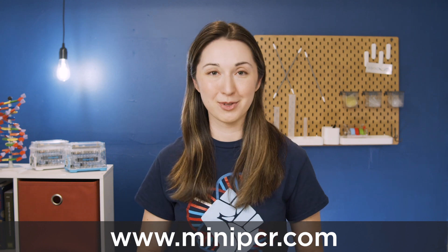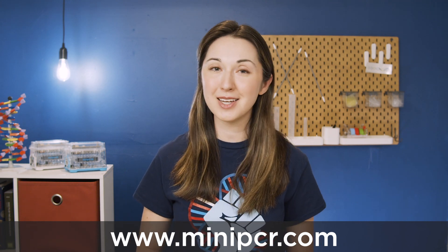Mini-PCR thermal cyclers are small and durable for the field, simple and intuitive for the classroom, and precise and sophisticated for the molecular biology lab user. To learn more about the Mini-PCR thermal cyclers, you can visit MiniPCR.com.